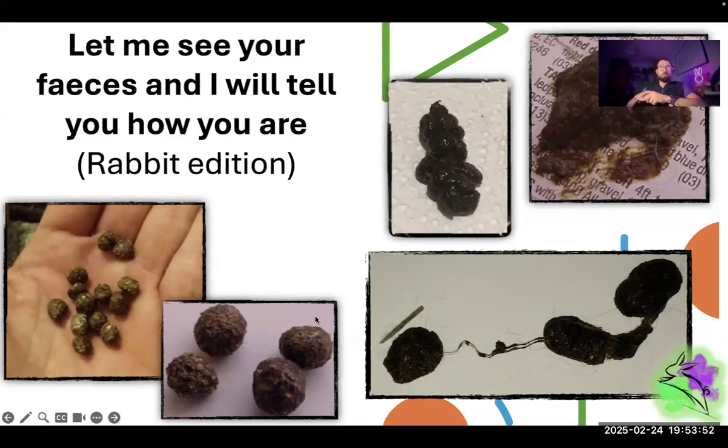If they are already rounded, the same size, no problems, it means that the rabbit is pooping well, and obviously we don't have a lot of concern. Differently, if we start to see quite watery or runny feces, like proper diarrhea, but we don't have to confuse a cecotroph for something pathological. So the one here, this tiny feces all attached together, this is the cecotroph, it is normal.